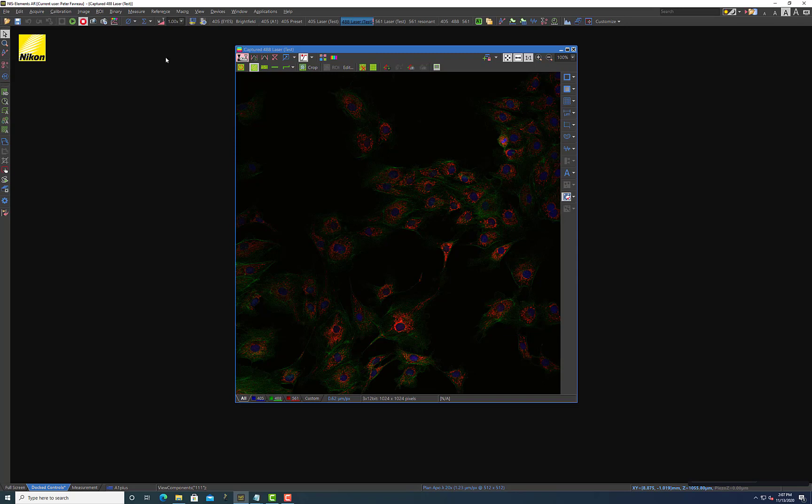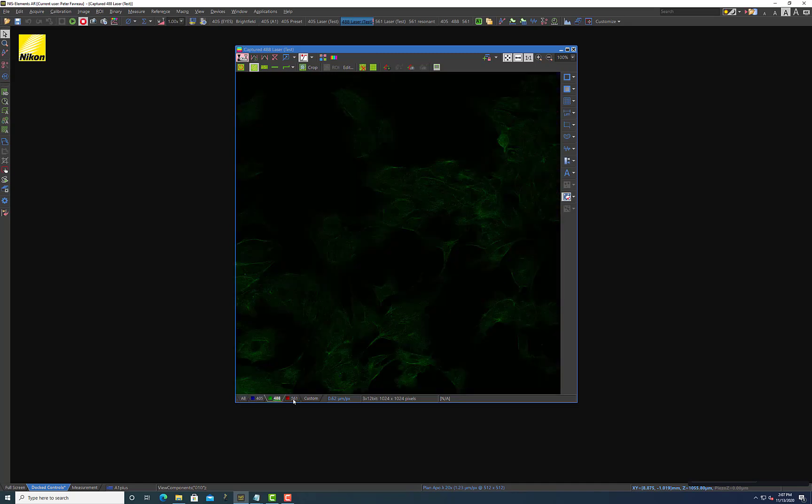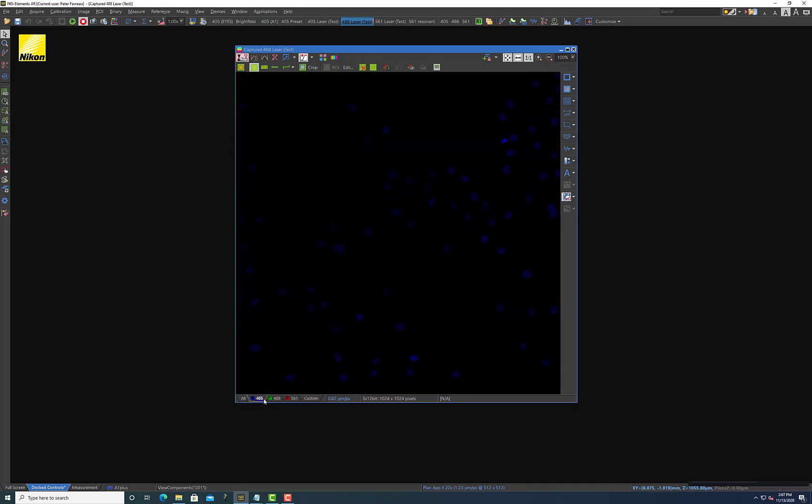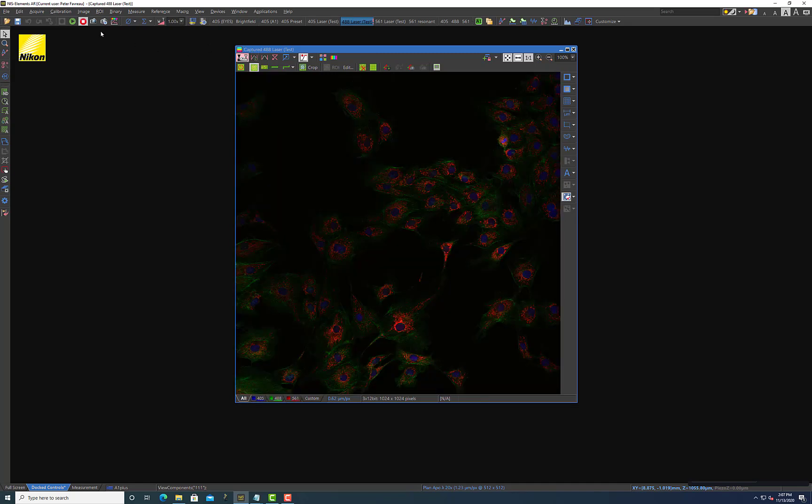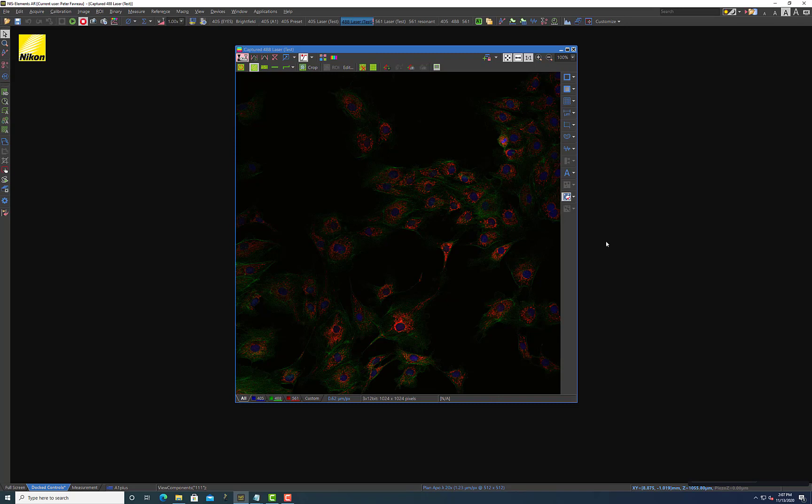So to begin with I just want to show you this image that I've acquired. There are three different colors present in this image and I captured it using just the capture button. The information I'm about to discuss is also relevant if you use the ND acquisition method of acquiring an image, which is what I would recommend someone do. But if you're coming from a situation where you just wanted to capture a couple images using this button then you'll be in this situation as well.